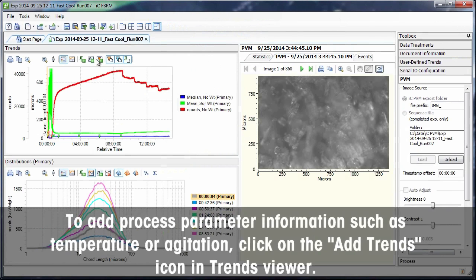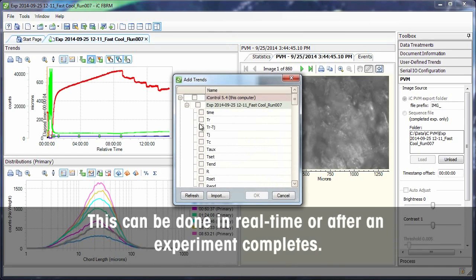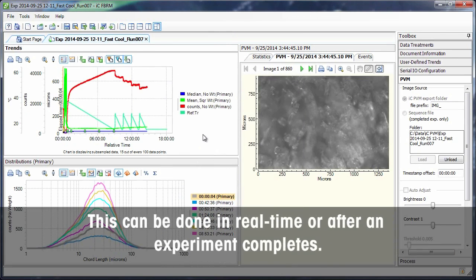To add process parameter information, such as temperature or agitation, click on the Add Trends icon in the Trends viewer. This can be done in real time or after an experiment completes.